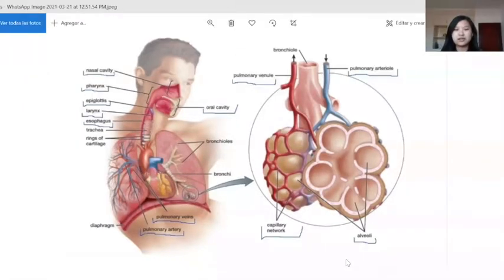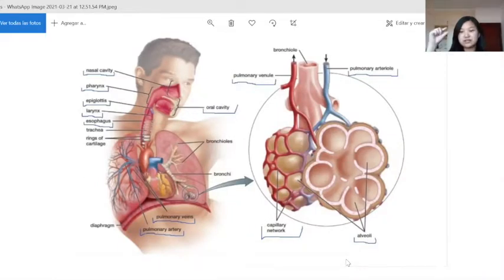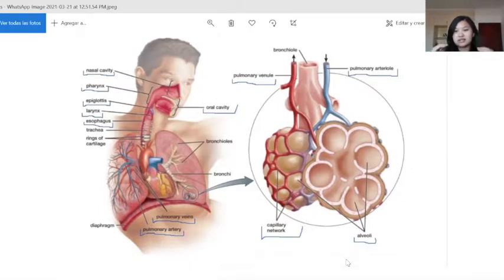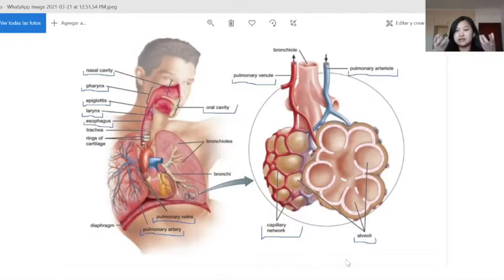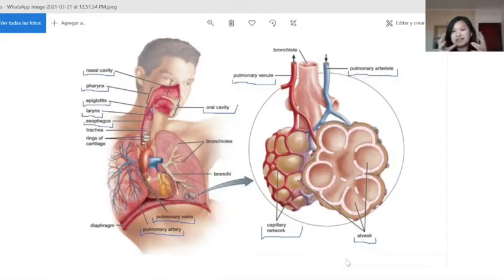Finally, the last organ is the diaphragm. The diaphragm is a thin skeletal muscle that sits at the base of the chest and separates the abdomen from the chest. It contracts and flattens when you inhale, creating a vacuum effect that pulls air into the lungs. When you exhale, the diaphragm relaxes and air is pushed out of the lungs.